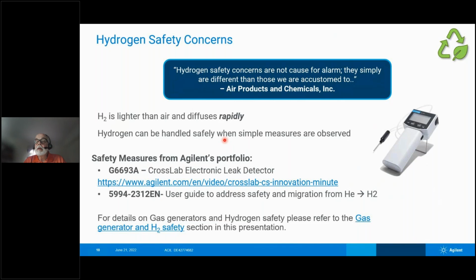How do I know that? I've been handling hydrogen for about 45 years. And many of our labs already use it with their flame ionization detectors and things like that. So in any case, I'll be offering some places where you can get more information on hydrogen safety, but our instruments have been designed to handle hydrogen for at least 40 years. And then later in this presentation, you'll hear about different sources of hydrogen, including the hydrogen gas generator.